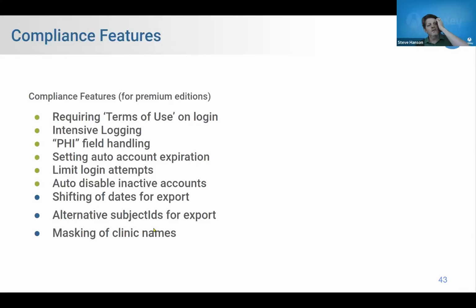We're gonna say a little bit more about this, but I'm just kind of giving you the ultra basics of security. There's a lot more to it. There's a lot of subtleties to it. And one of the ways that you can go to more advanced security is to look at the security features, the compliance features in LabKey.